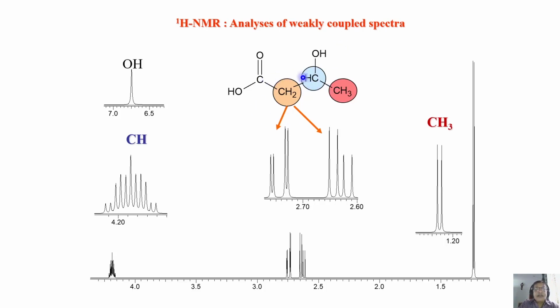It means I am telling these two protons are not equivalent. It is not a CH2 group. They are non-equivalent protons. Oh, something interesting. Fine. If they are non-equivalent protons, now can we explain this pattern? How does it come? Let us try how to do that.